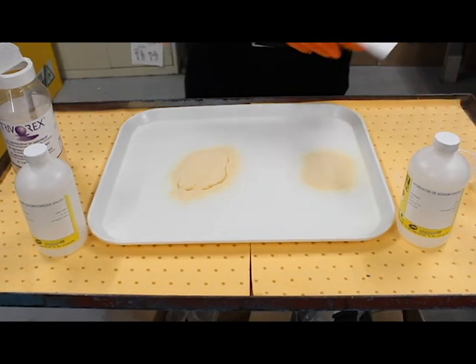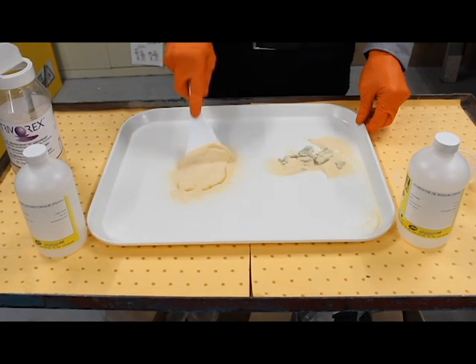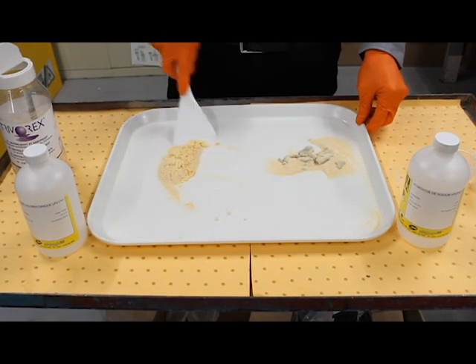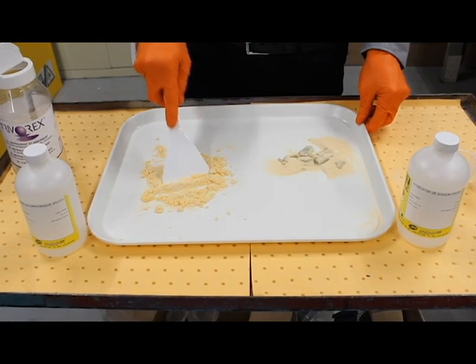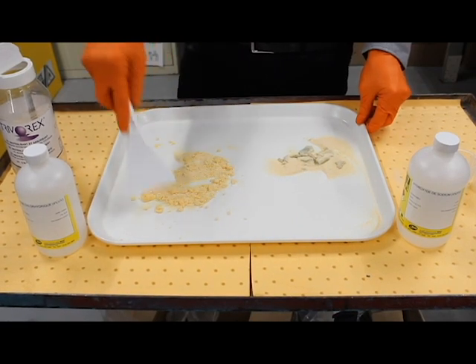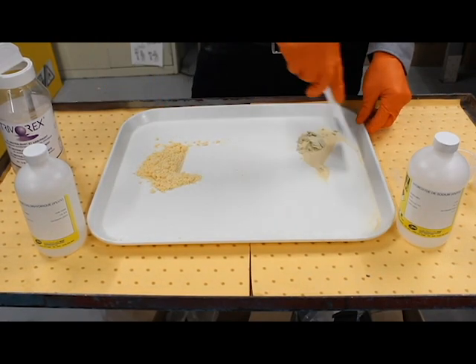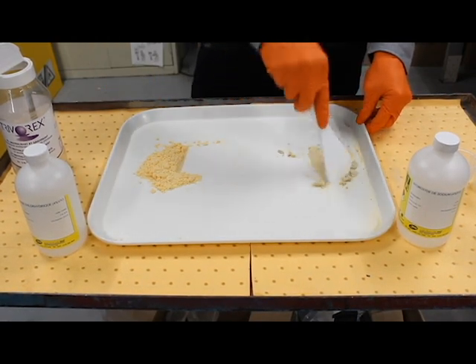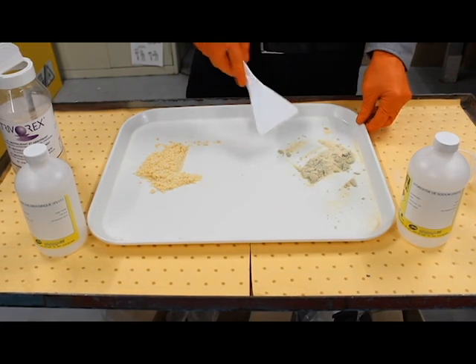So we'll start to move that substance around for the cleanup — same with the acid. Just keep them separated for now. You can see that the pH indicator has gone from the pink color back to the original color of the Turborex. That's the neutralization process happening there, indicating it's gone from a hazardous to a non-hazardous chemical.